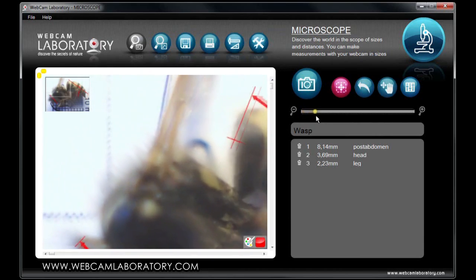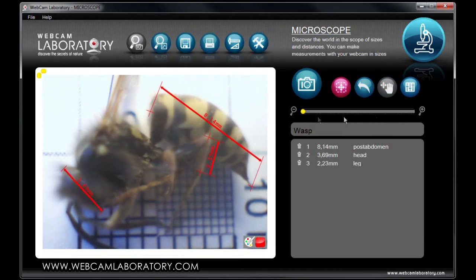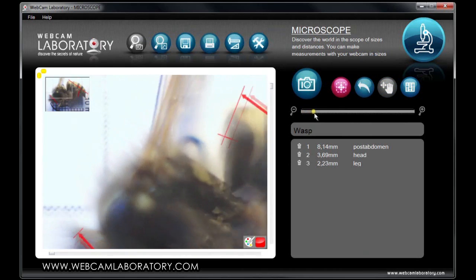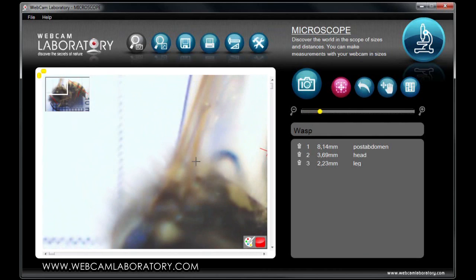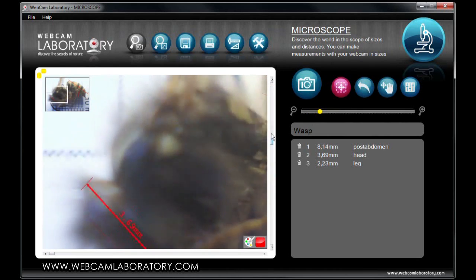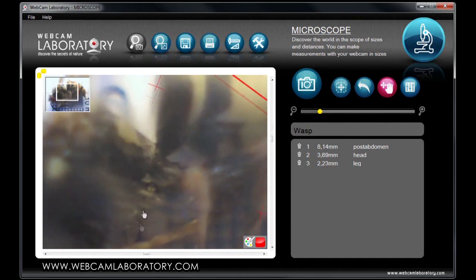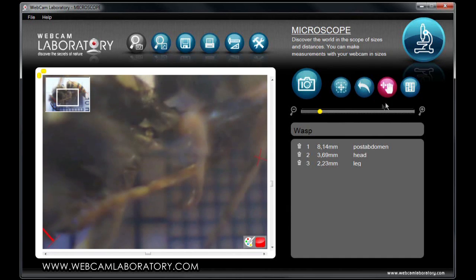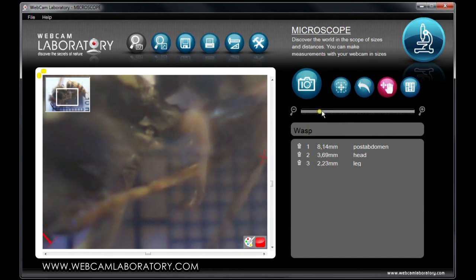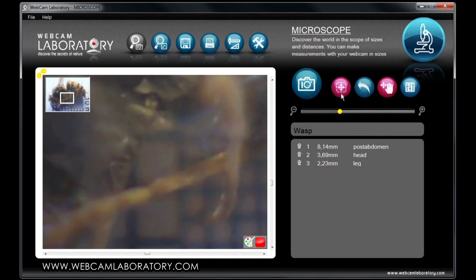During measurement, you can zoom in by using the slide bar on the right-hand side. After zooming in, you can move the picture by using the scroll bars on the side or the move picture button on the right-hand side. Using this function, you can make measurements in very small sizes — for example, you can measure the thickness of the wasp's leg.